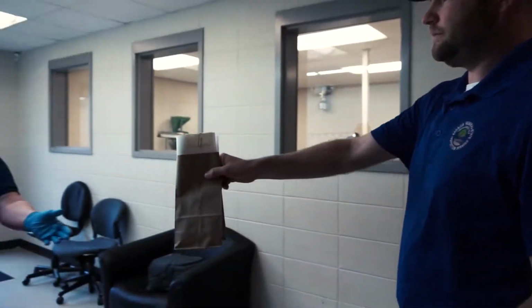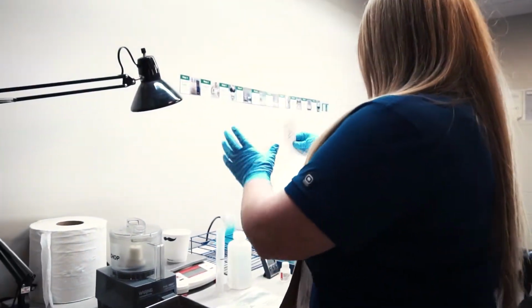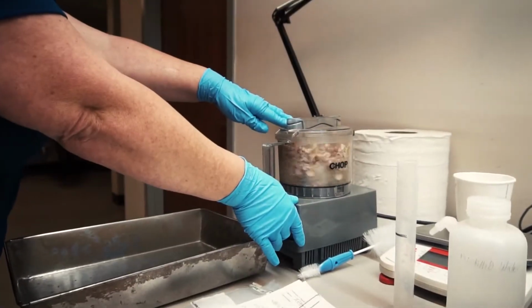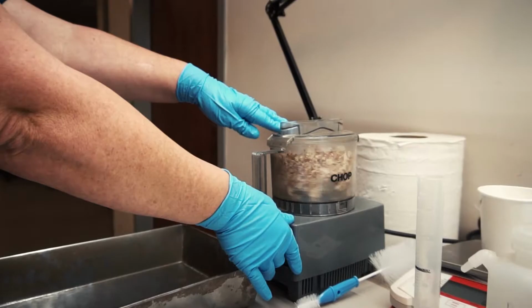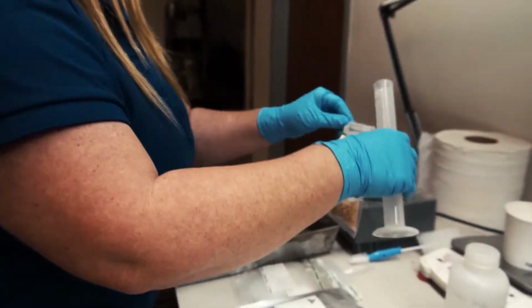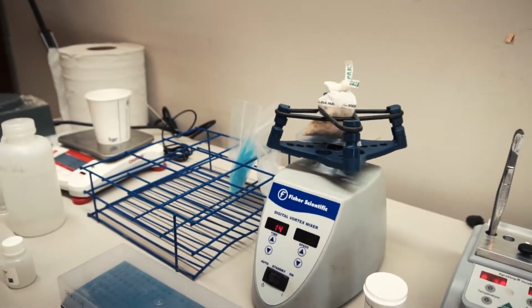The aflatoxin testing procedure used in this video represents only one type of kit available for use throughout the industry. This farmer stock aflatoxin test begins by grinding the LSKs and damaged kernels. 10 grams of the ground sample are removed, and a buffer pack and distilled water is added.